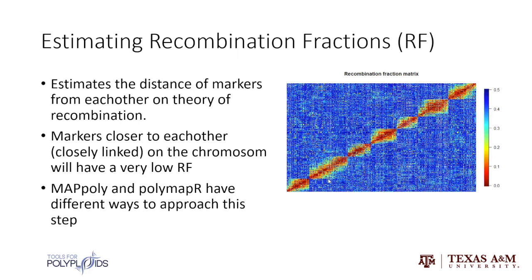And I've been working a little bit with GBS data, and GBS data doesn't have as strong of this red. So if you work with GBS data, you'll see a little bit different pattern. But this is what we're all striving towards.